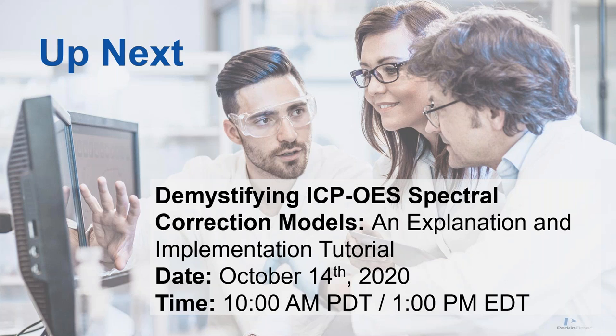Neb flows, again, will move where the carbon bullet is. And those will be generally higher than we normally use. So instead of 0.7, maybe up around 0.8. But again, with these, it's more a visual thing. You have to look, each individual instrument will be slightly different. So it's always good to run them, observe, and make adjustments based on the observation of how the plasma looks when you're aspirating the organic.